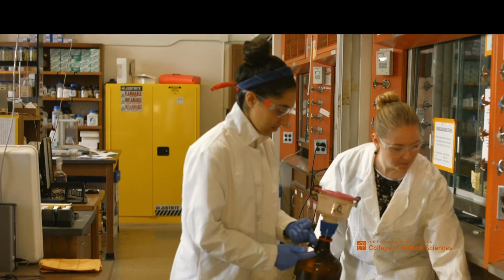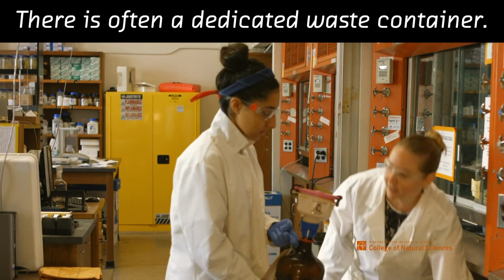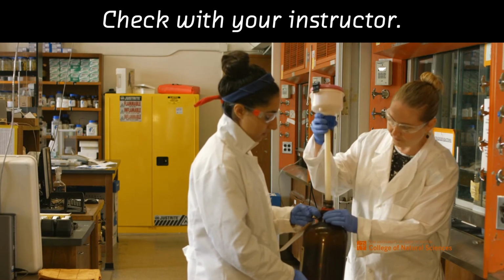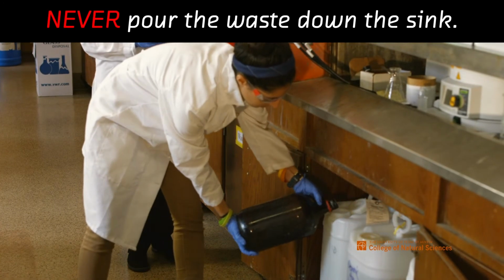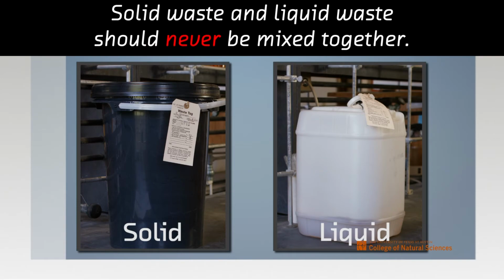In instructional labs, there will often be a waste container dedicated to the specific experiment that you are performing. Check with your instructor if you are not sure where to put your waste, and when in doubt, never pour the waste down the sink. Solid waste and liquid waste should never be mixed together.